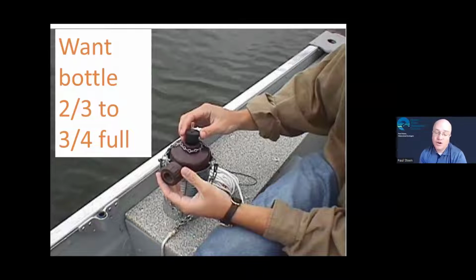Maybe all of your water is actually from the bottom of the lake, and you didn't get any of that surface water or the mid depths of the lake. And remember, the goal is that we're trying to collect water over the entire depth. So if it's full, maybe you pulled it up too slow. Then you would just dump it and try again, pulling faster this time.